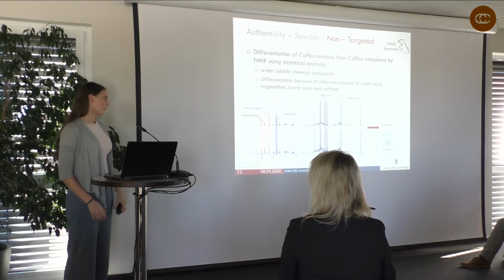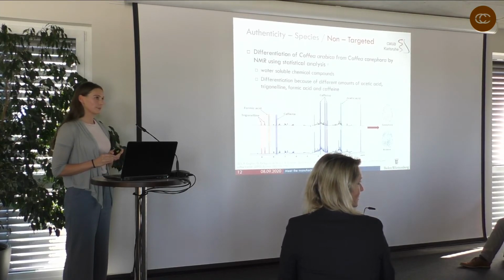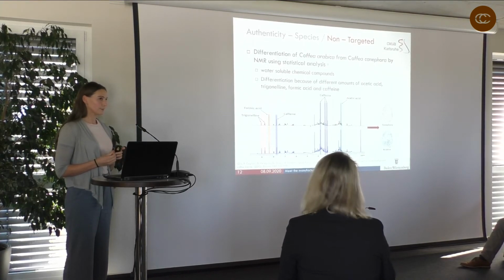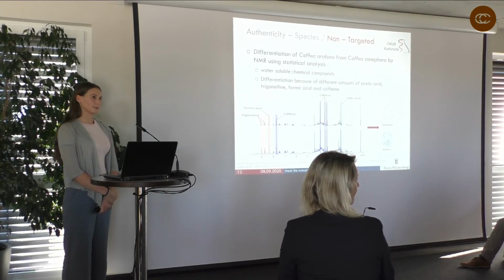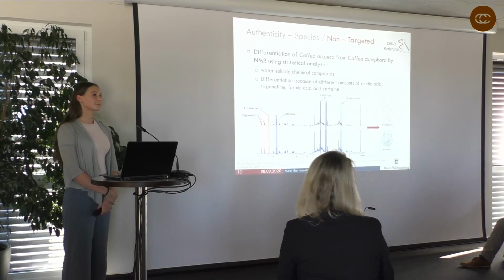Yeah, I think Dr. Brödel can also confirm that when we were looking into multi-TOF analytics, in the very beginning also we had to really zoom into some areas, but then we found some areas that were absolutely significant. But you have to have a poor guy that is looking through whatever 25,000 peaks and then finds the right area in which you find the difference. But once you know where you have to look, it's very easy. You just have to have anyone that is doing it, let's say, for a bachelor or master thesis, or if that is not enough, then for a dissertation. But there are people that will sacrifice life energy for it.